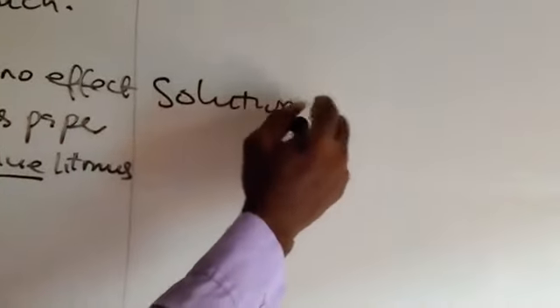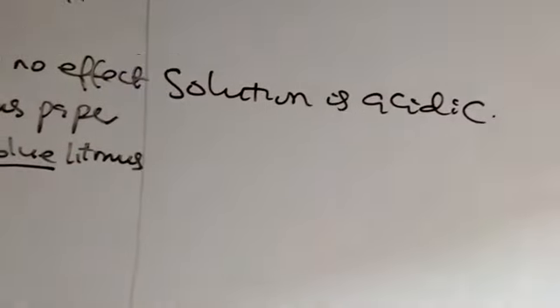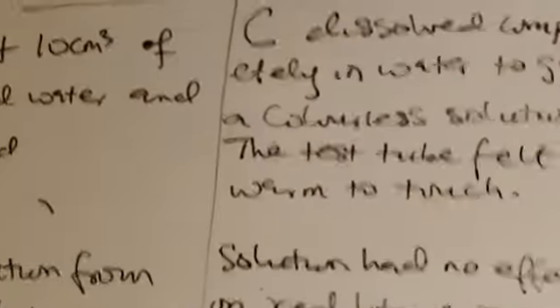So for the inference, now say solution is acidic. Solution is acidic. So take a few seconds to go through our work before we go to the next question.